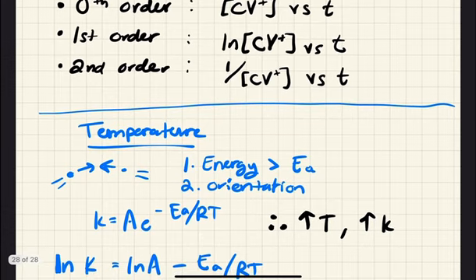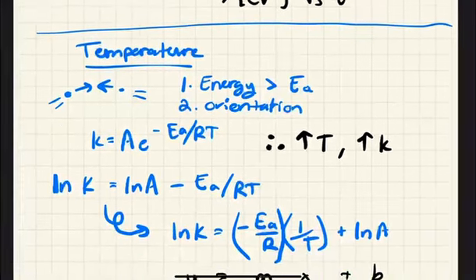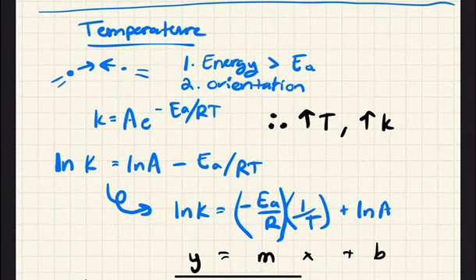After we've finished that, we will also compare the concentrations of hydroxide at multiple different levels so that we can try to intuit what the kinetic order of hydroxide is, in addition to just this crystal violet. In the second part of the experiment, we'll also consider the effect of temperature on the rate of the reaction.